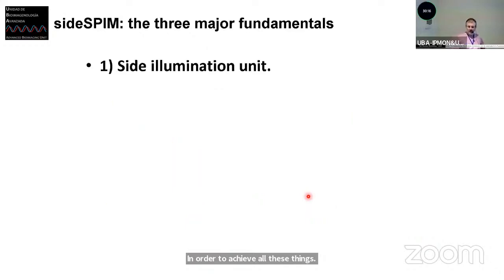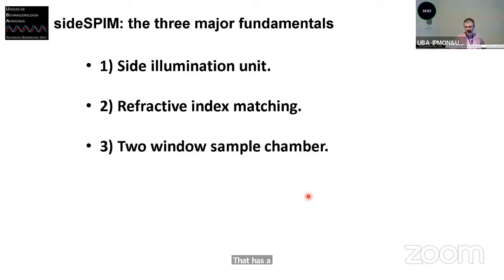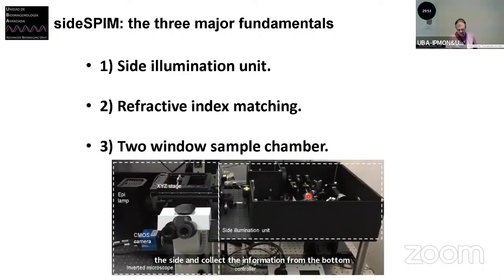So what we finally decided was to build a new microscope, which was a new illumination unit that has a matching of the refraction index between excitation and emission. And it requires a chamber that has two windows in order to illuminate from the side and collect the information from the bottom. And this is the microscope that I'm going to describe in a minute. So this is the side illumination unit that was attached to a commercial epifluorescent microscope. This is an Olympus microscope. And then we have the camera that we have in this microscope. We only include here a wheel in order to change the different emission filters.